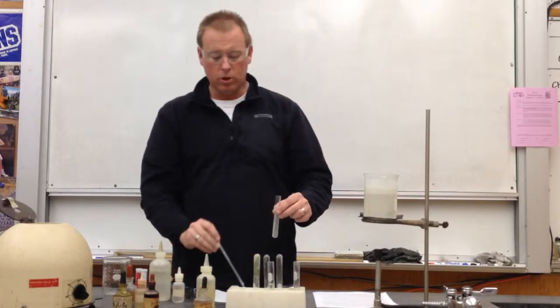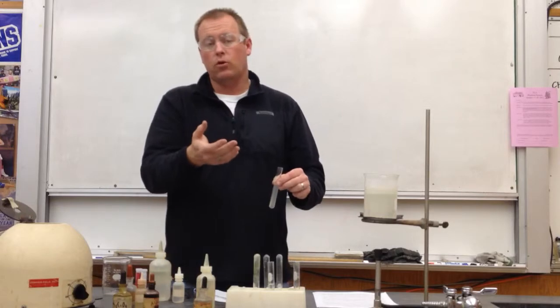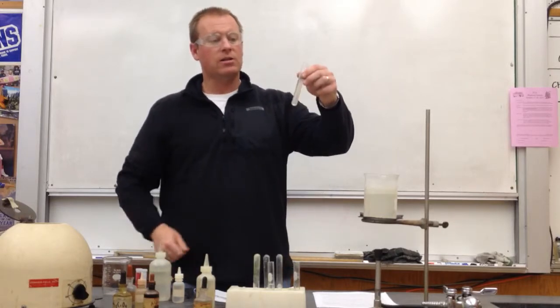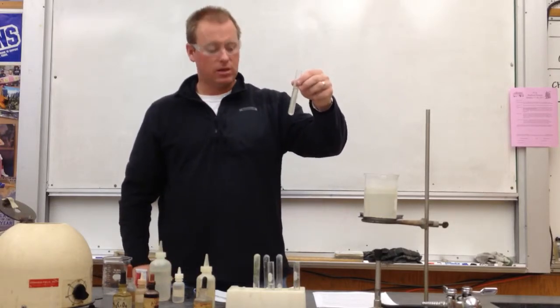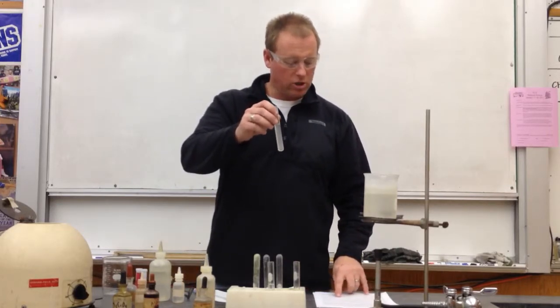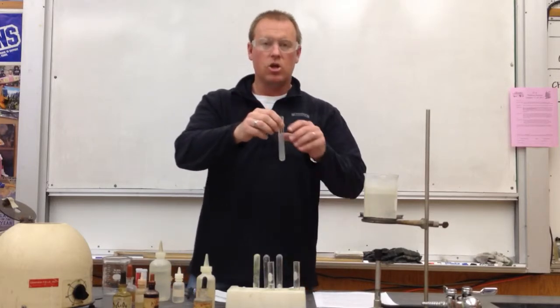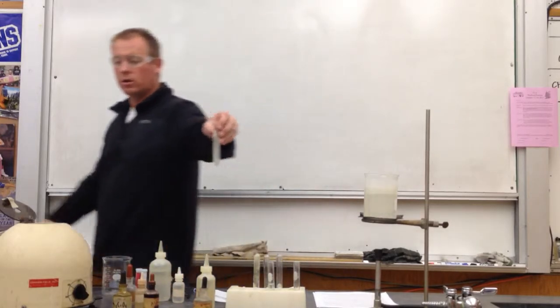Now the paper's turned blue, so I know it's basic, and since it wasn't basic 3 or 4 drops ago, I know that just in the last few drops it has become basic. Now if we take a look at the procedure sheet, it says that a white or grayish flocculent precipitate means aluminum may be present. So I'm going to bring this around for a little closer look.